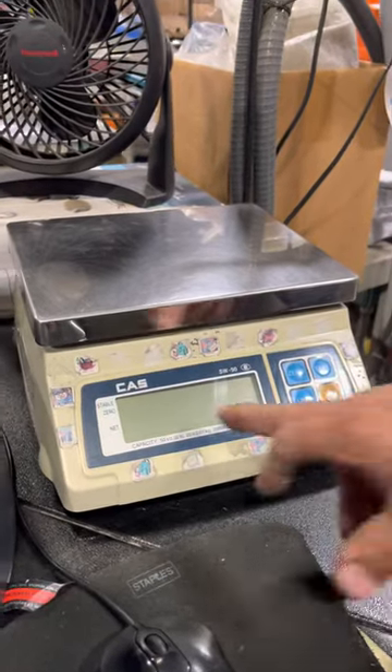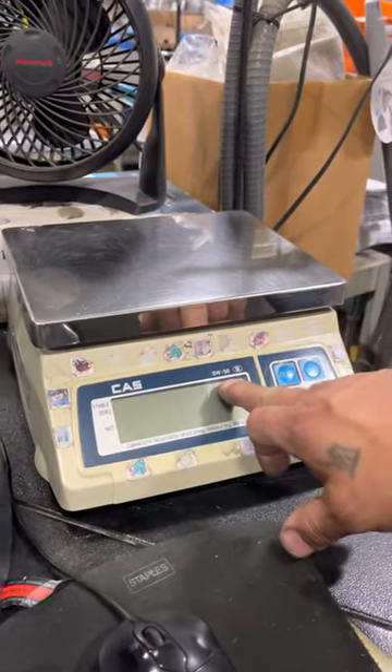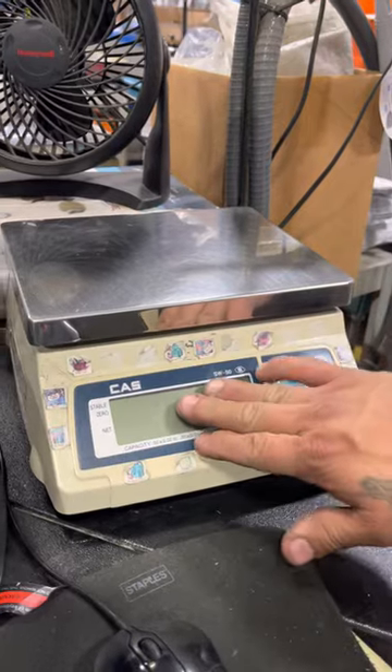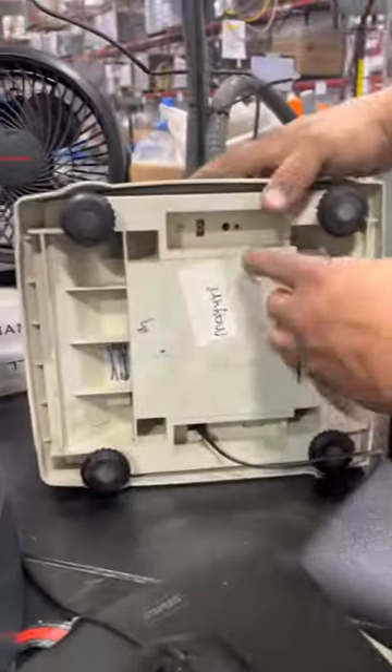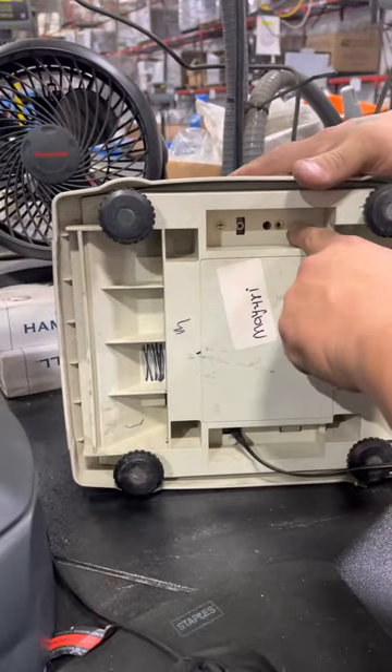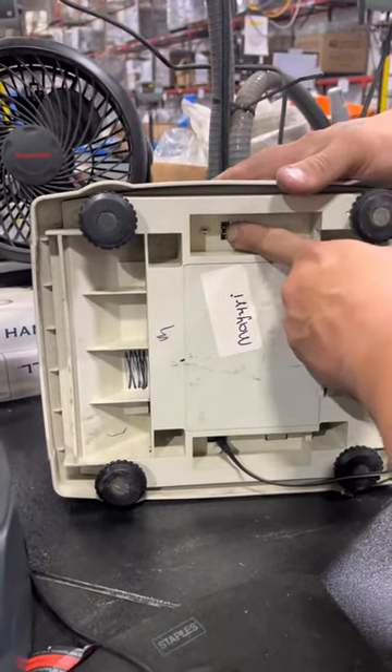This is a calibration adjustment of a CAS SW series scale. Right now it's off. Underneath here there's a plate — most of the time there's a plate, it's not there — but that little button right there, you have to hold that in while you're powering up the scale.